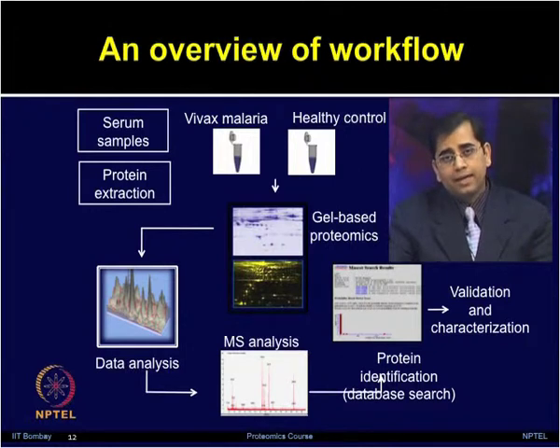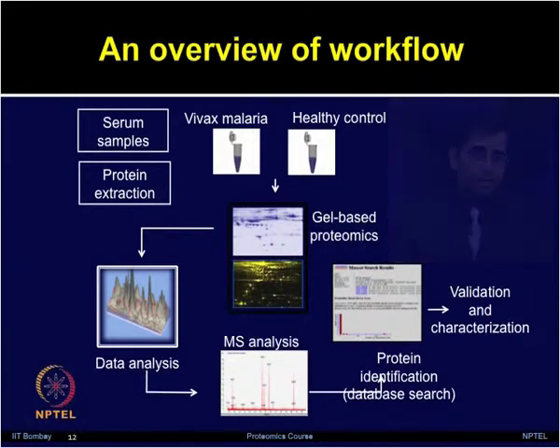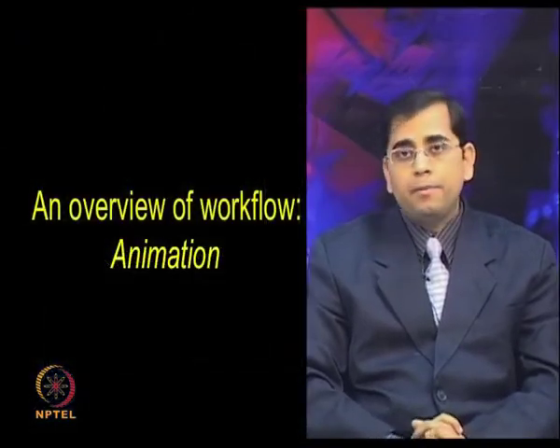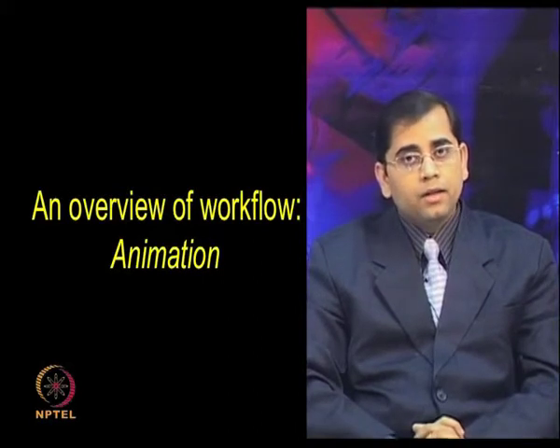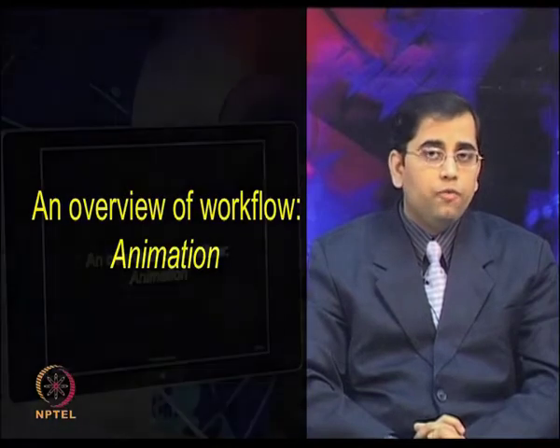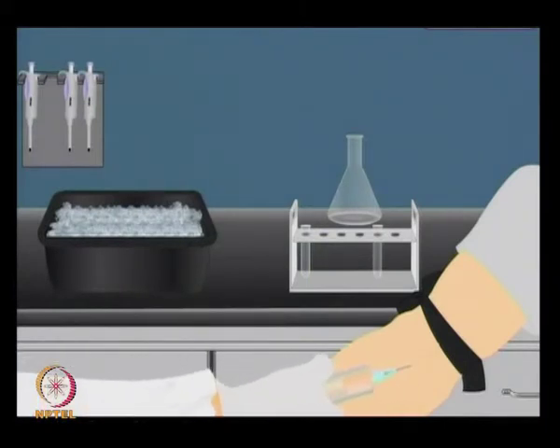Further, we validated a few targets and analyzed the data for various pathways which could be involved in such a disease. So, before we move to details of various experiments performed in this study, let me show you this animation to give you an overview of the workflow followed in this experiment. Let me give you an overview of all the steps involved in performing such an experiment.